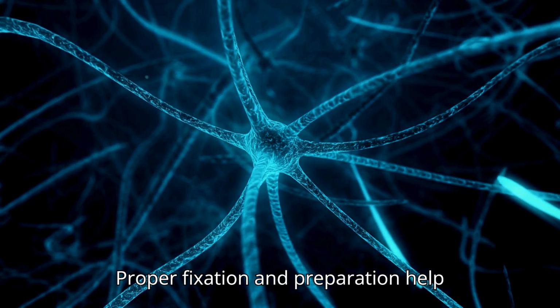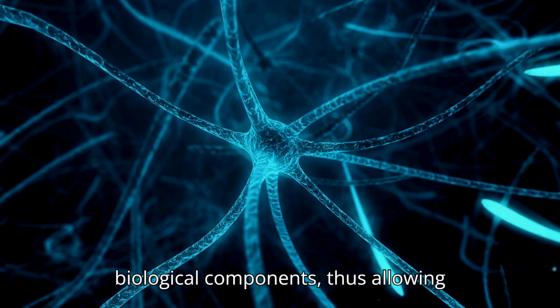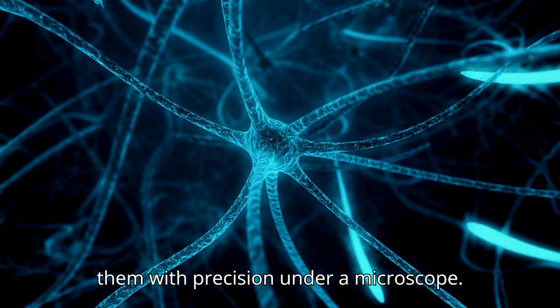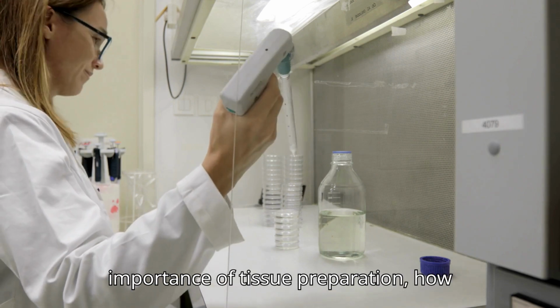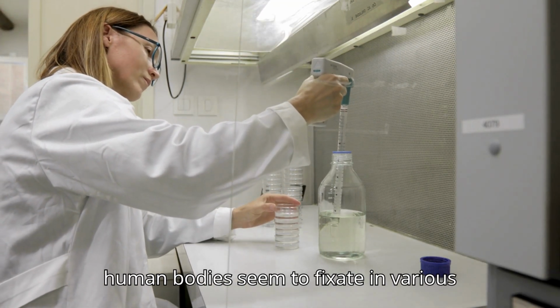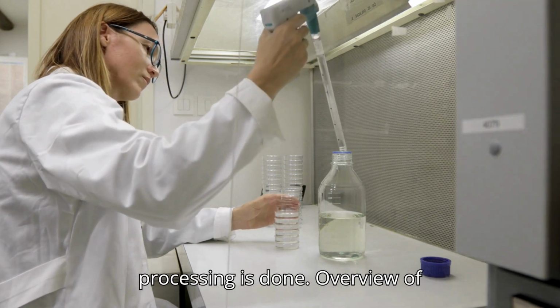Proper fixation and preparation help preserve tissue structure as well as biological components, thus allowing pathologists and researchers to study them with precision under a microscope. In this video, I will summarize the importance of tissue preparation, how human tissues are fixed in various ways, and what happens after tissue processing is done.